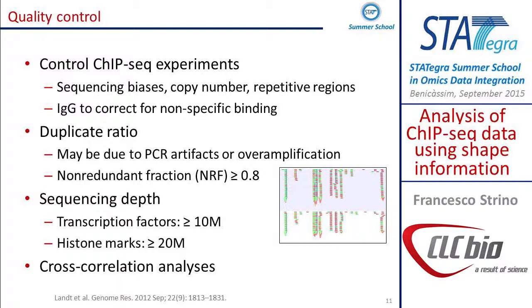Another thing is repetitive regions. You will have microsatellites or retrotransposons, pieces of DNA that are copying all over the DNA, so they will look like there are many copies of them. You will get a lot of reads just because there are several copies. Also, centromeres and telomeres are extremely repetitive, so anything mapping there will often have a very high number of reads, just because it's a repetitive region.